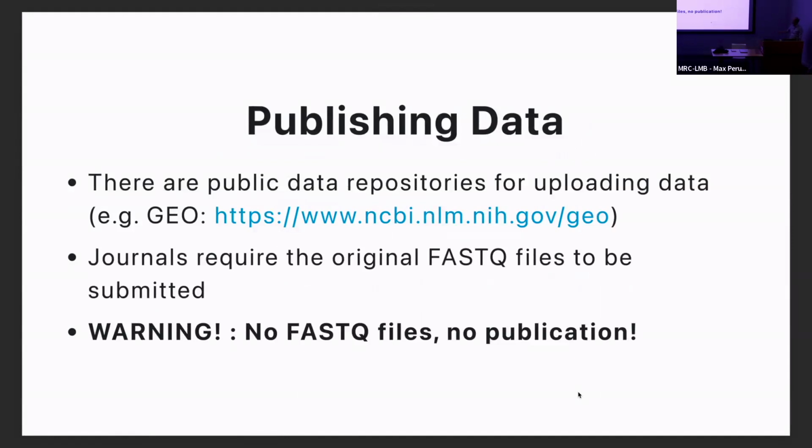Just at the end, so you've done all your work, you've done all your analysis, I just wanted to mention again, when it comes to submission, you do need to provide FASTQ files. This is probably my second slide that I want you to take away. You will need those original FASTQ files. You don't want to lose them.